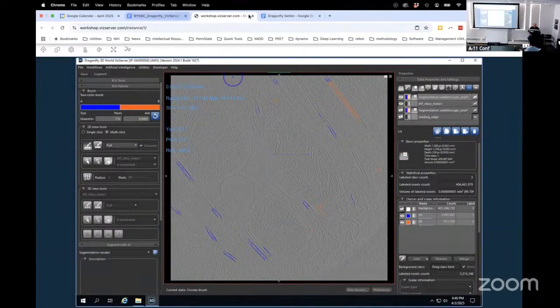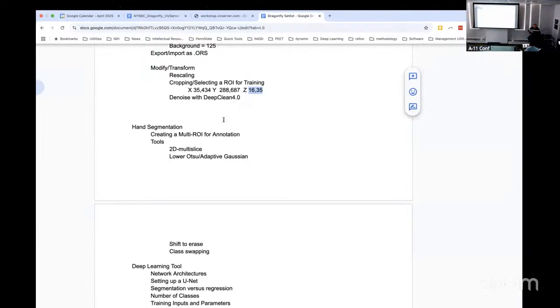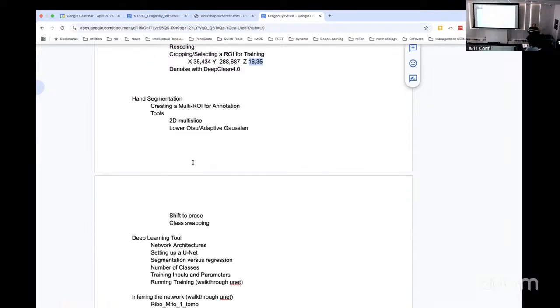All right. So what are we doing now? I had another tomogram we could infer to, where it does a worse job, and I was going to show you how you would retrain a network to be good at more than just those two tomograms. I don't know how useful that is.